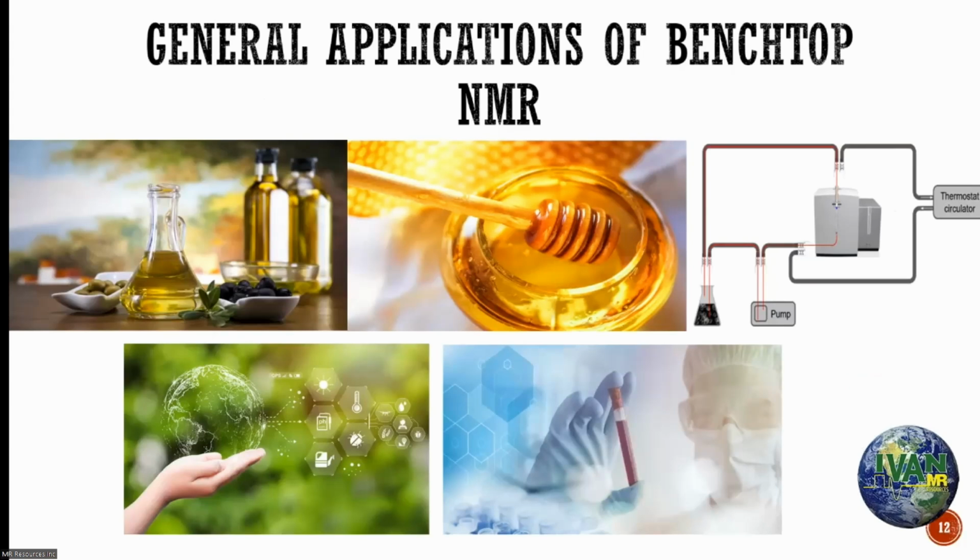There are various applications of Benchtop NMR right now. One of the common applications is to look at food adulteration. In this case, we're looking at the authentication of olive oil and honey. And recently, this Benchtop NMR system has been used for reaction monitoring, where it is now possible to essentially sip out aliquots from your reaction mixture and monitor the rate of the reaction and the formation of the product. And there's a push to use these Benchtop NMR systems as a diagnostic tool in hospital settings, where you can look at biofluids like urine and blood to look for biomarkers or start doing disease profiling.